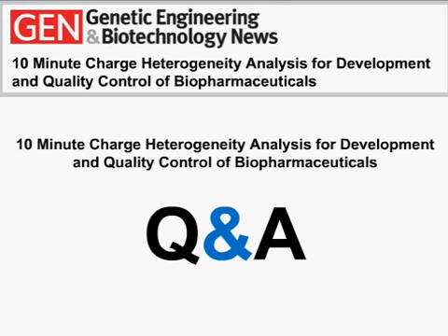Okay, and another, Carrie. Regarding protein interaction and pI shift, is the assay under denaturing conditions, that is, containing urea? No. In this case, we did have glycerol in there. We noticed when we did some development that we needed to include that as an additive for the most reproducible profile, but we do not include urea in the sample prep for that protein.